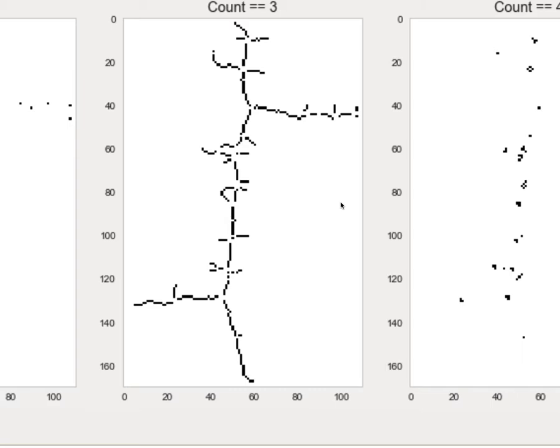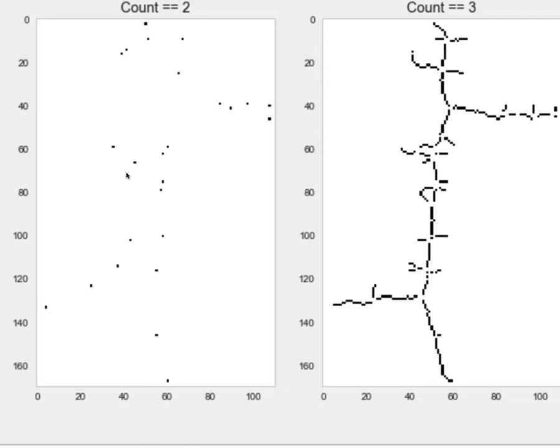This is a little bit problematic here because we see that there's a junction there and a junction there, which means this segment gets counted as a very short segment, and so you might delete it even though it belongs to a much longer segment. So just doing the component labeling might be too much of an approximation, which is where it can be useful to start from the endpoints or the junctions and grow out to evaluate it.